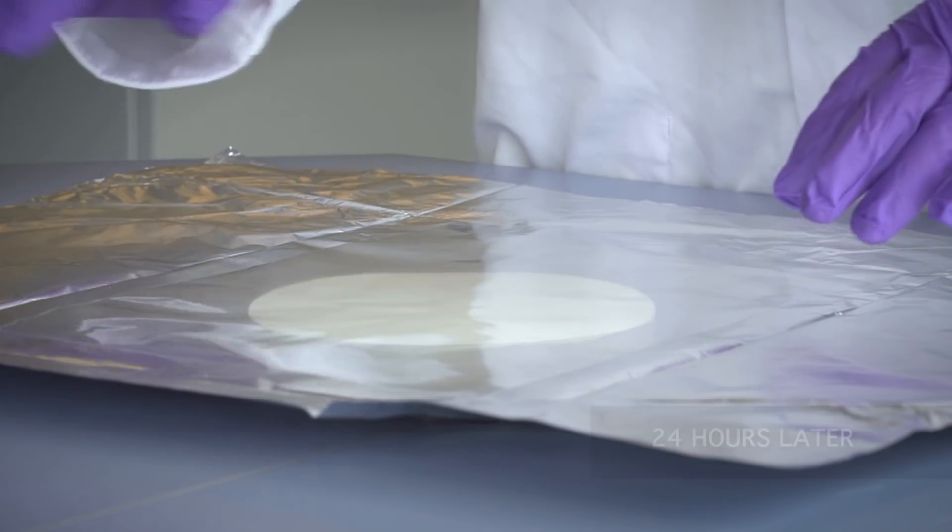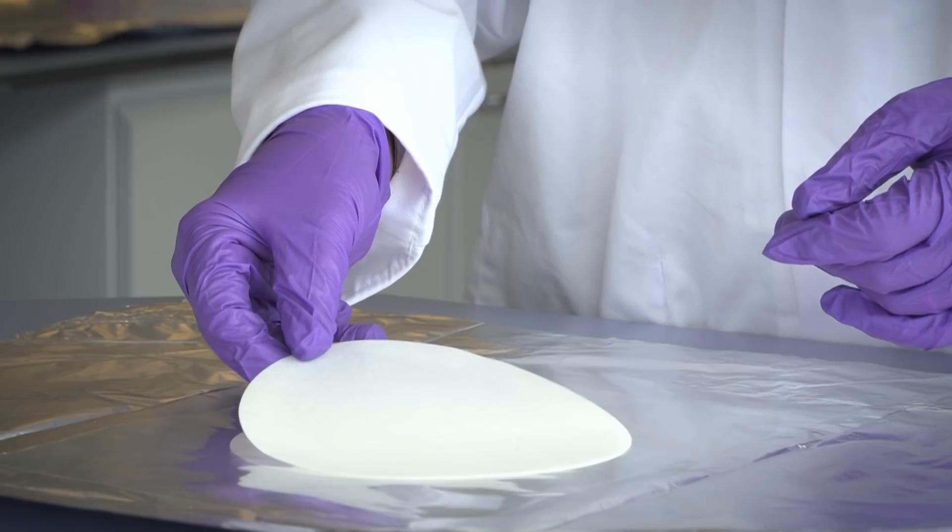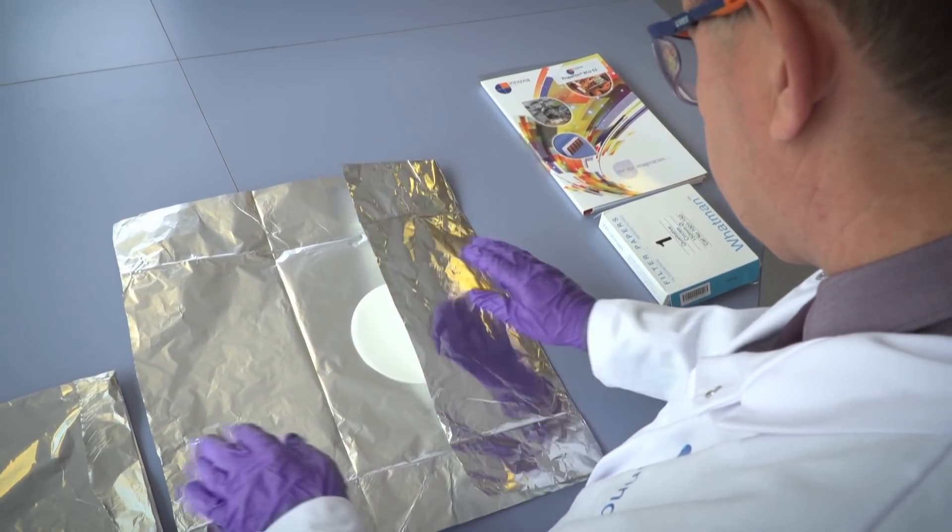We then put the piece of packaging film on top that we want to test, and then we put a food simulant or a receptor on top. This will pick up any mineral oil that migrates through the packaging film.